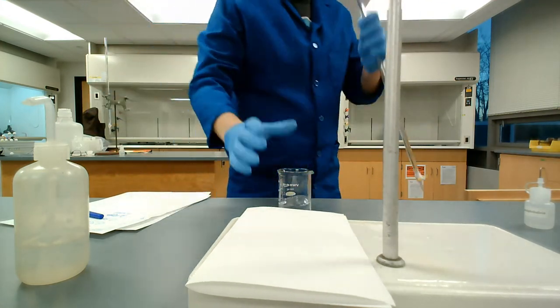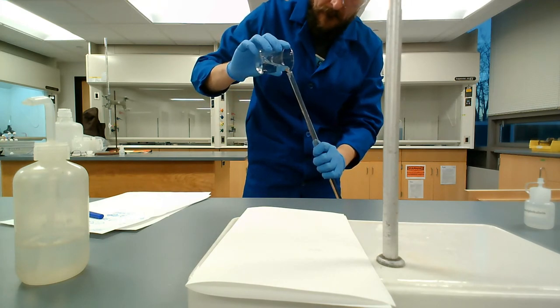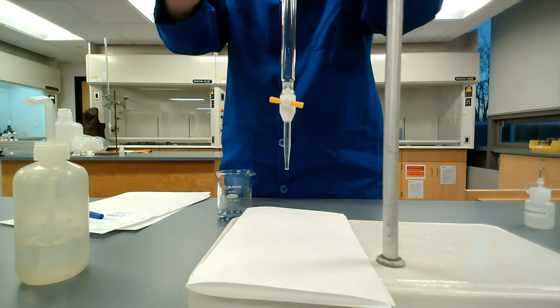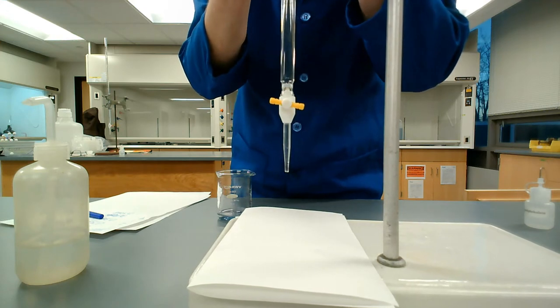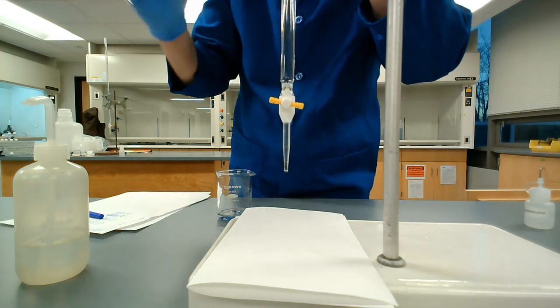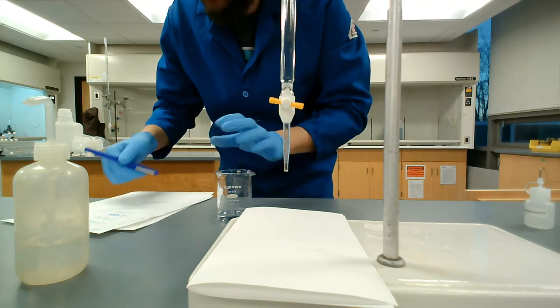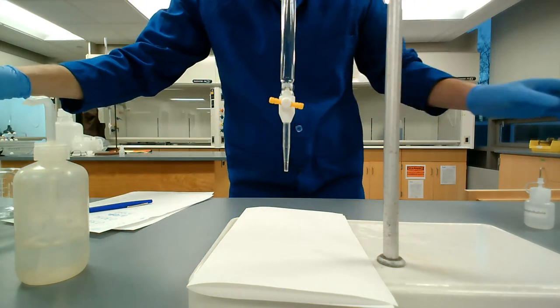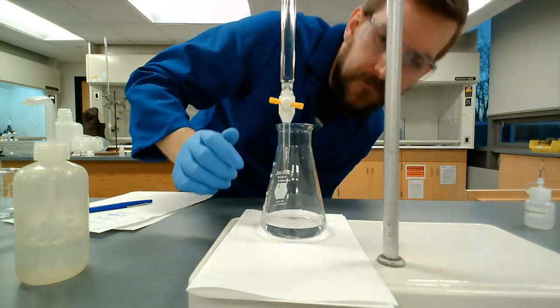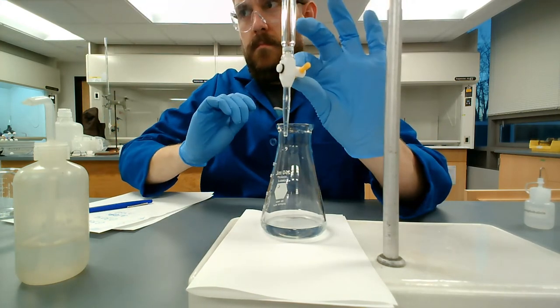I'm going to refill the burette here really quick. I used, I think, about half of the burette in my titration, so fill this thing back up, get my new burette reading. Alright, record that. Grab my second Erlenmeyer flask. I have to raise the burette up a little bit here to get the Erlenmeyer flask underneath it.